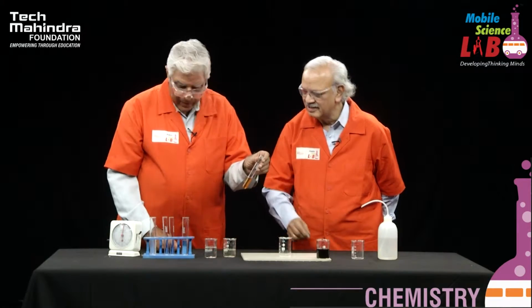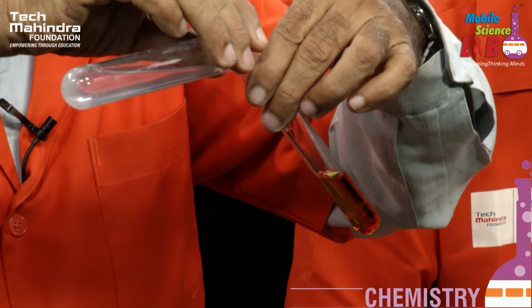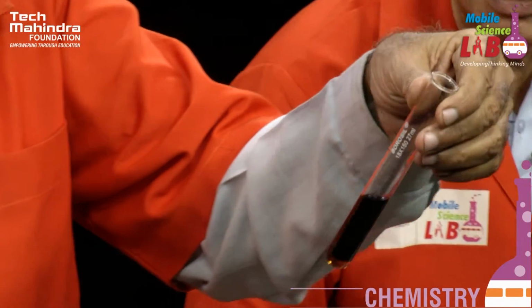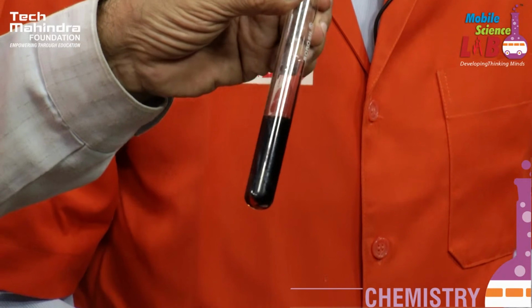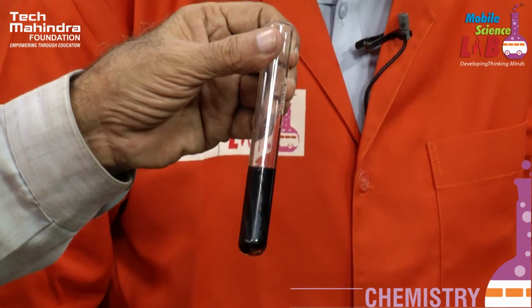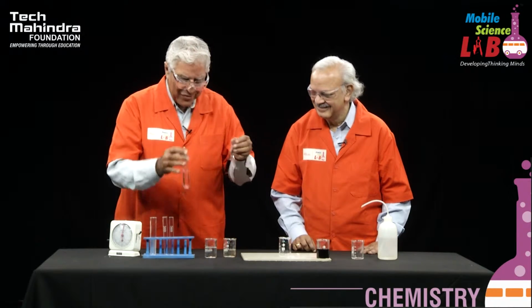Now to this you add starch. I'll add 1 drop of starch into it. Typical starch iodine complex. You see, there's an intense dark blue colored complex being formed over here. Now you add hypo to this. Now I will add hypo to this.